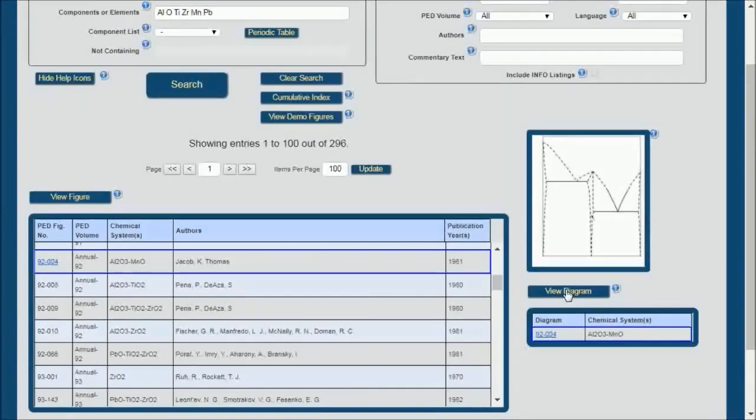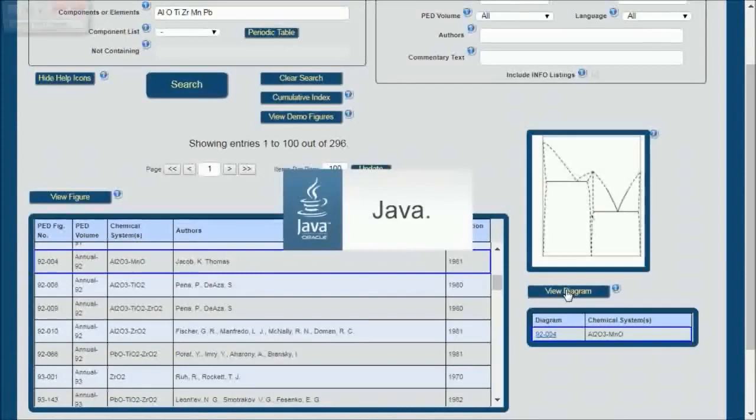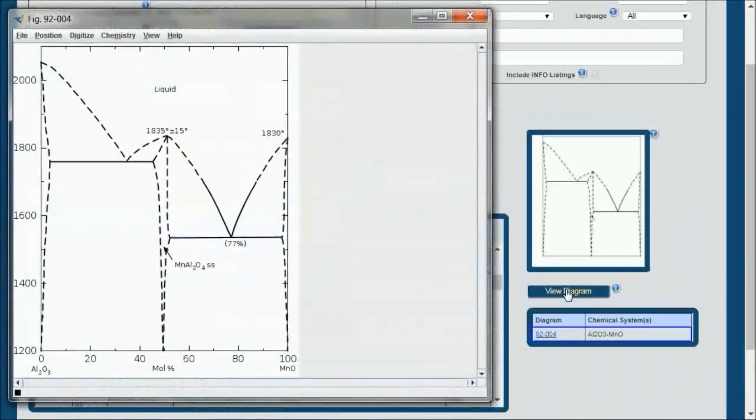This time we'll move over here to view diagram. When I click on view diagram, the Java-based phase equilibrium diagram viewer pops up. This viewer allows interactive analysis of the diagram.